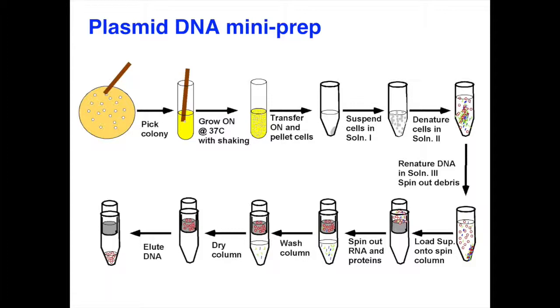Will not be able to sequence your sample, and you'll know when you load the sample into the gel, because your samples will float away. So it'll make it light and actually drag the samples upward. So right now, at this step, we add the elution buffer, and we elute the DNA. And again, this is a step where please don't throw this out.